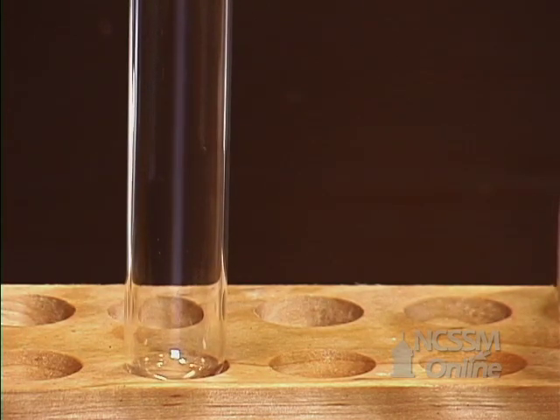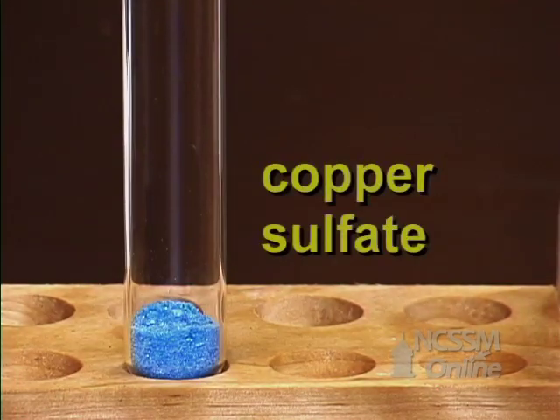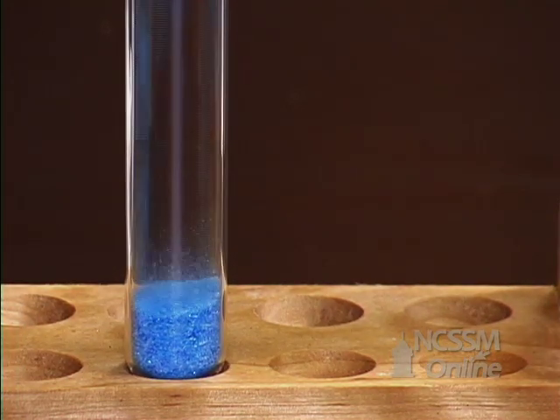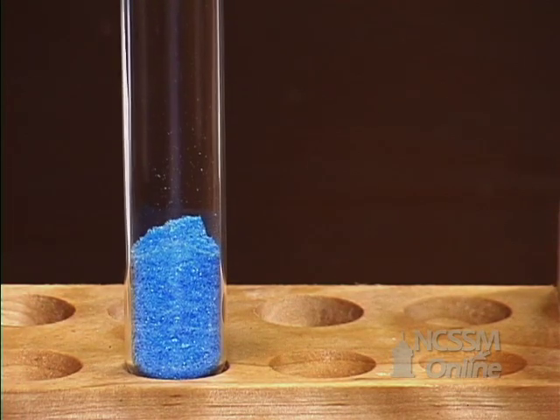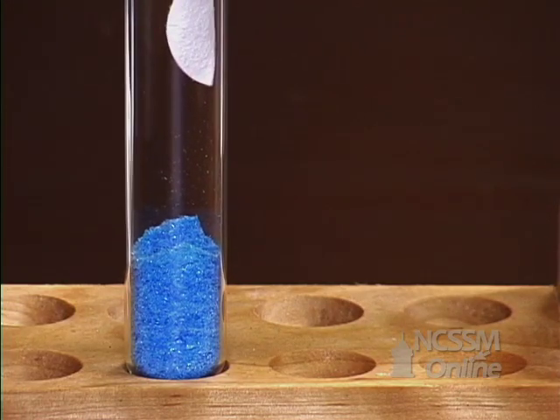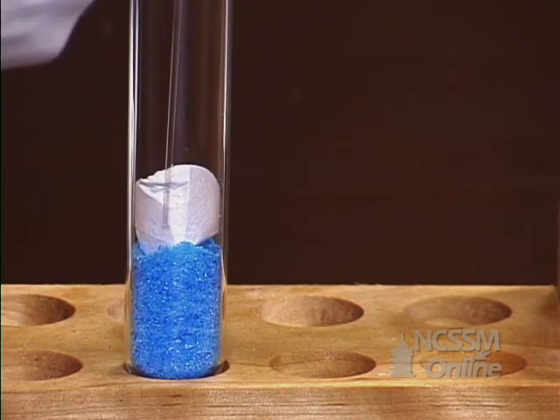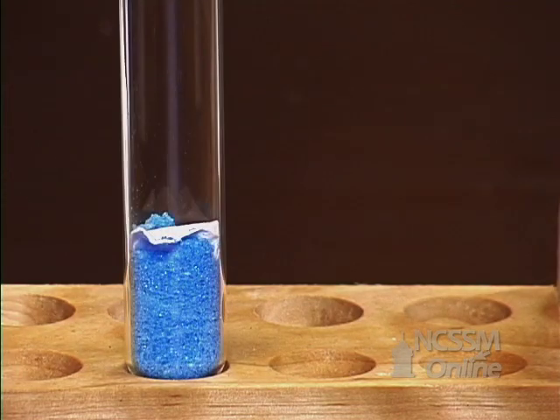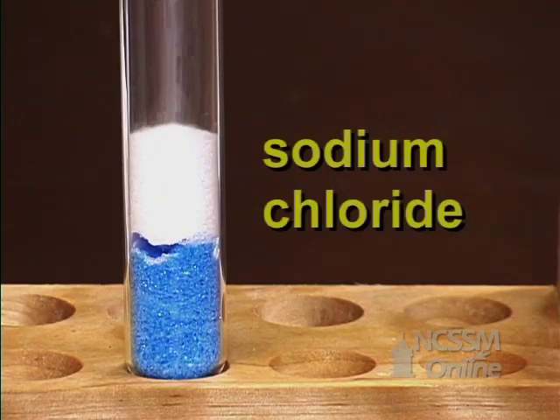First, take a test tube and put about an inch of copper sulfate in the bottom of the test tube. And then take a piece of filter paper — if you don't have filter paper, something like a coffee filter will work — and put that just down into the test tube to sort of make a little barrier. On top of your filter paper, pour in about an equal amount of sodium chloride, just table salt.